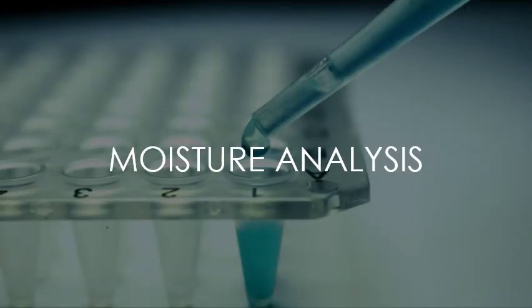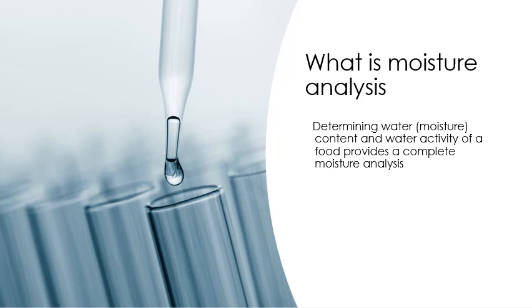Let's move on to moisture analysis. So what is moisture analysis? This is an analysis to determine water, which is moisture content, and also water activity of food, to provide a complete moisture analysis. We are talking about adsorbed water as well as free water here. Chemically bound water, unfortunately, is not going to be measured using this moisture analysis.